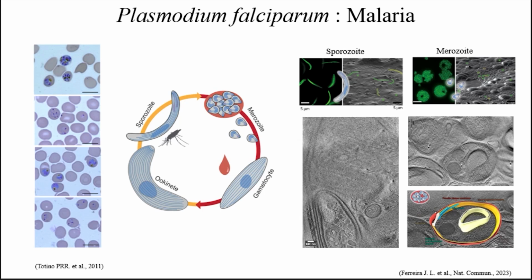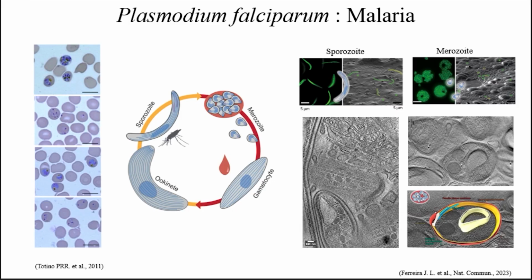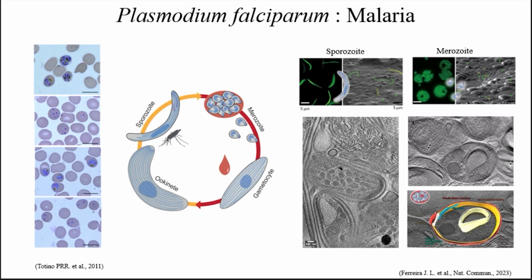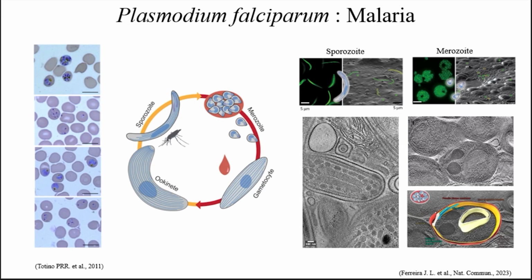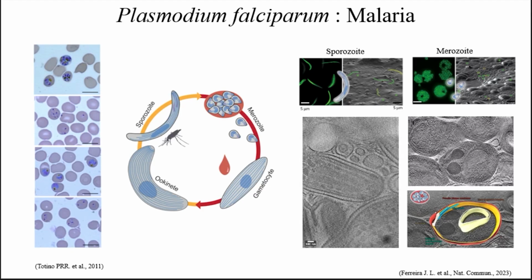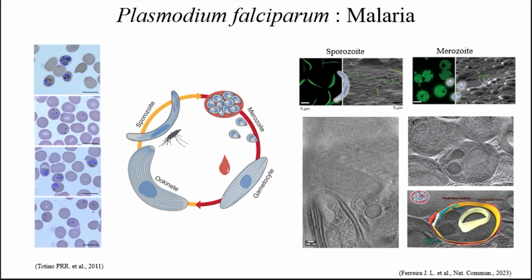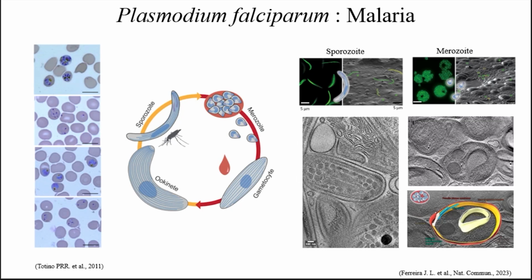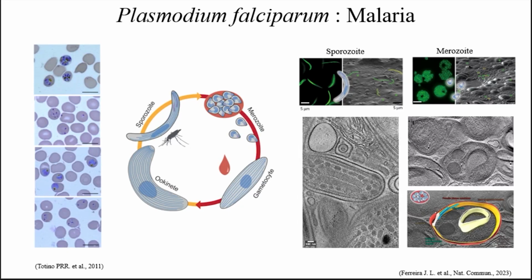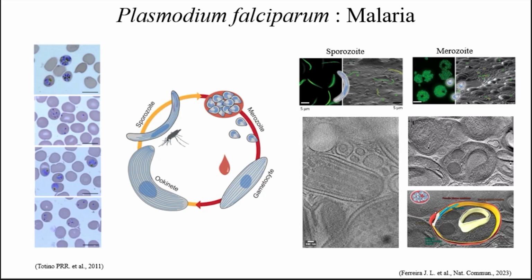Here, in light microscopy, you will see something like this small one. And then on the grid, the small ones that you can make out, those are these cells. Then you can have a 3D volume of that here. So we can identify from this the different features of the parasite. I can identify that this is a membrane, this is the nucleus, there are cytoskeleton elements like microtubules, which is my next topic actually. So with all this information you can study the parasite, how it behaves and how it works. This is one way of looking at this.